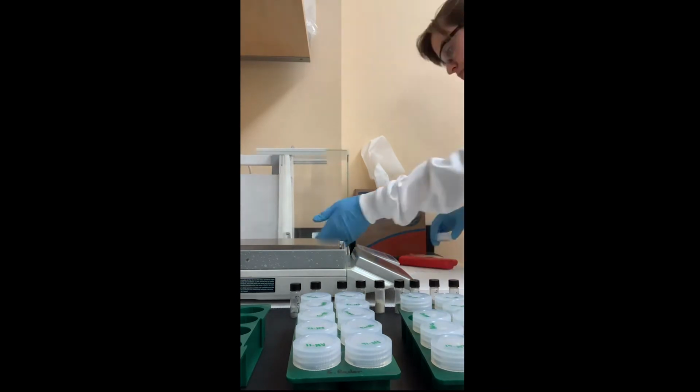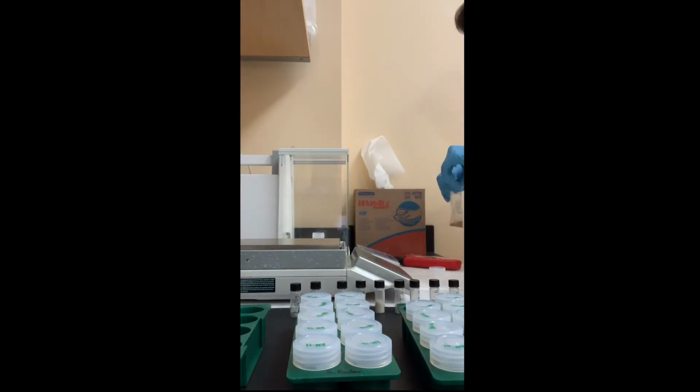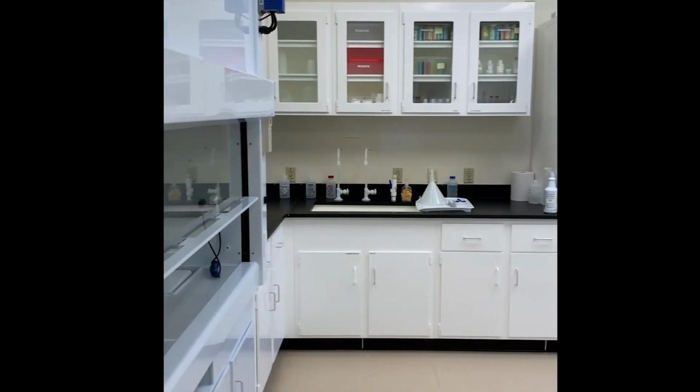Once the samples are weighed out, they're ready to go to the clean room, but before that, we have to get dressed up in something fancy. Because the metals I'm interested in are present in such low concentrations, we have to be really, really careful about contamination. So you might expect, since I'm interested in metals, that my lab has to be metal-free, which is true, and I'll show you that in just a minute.